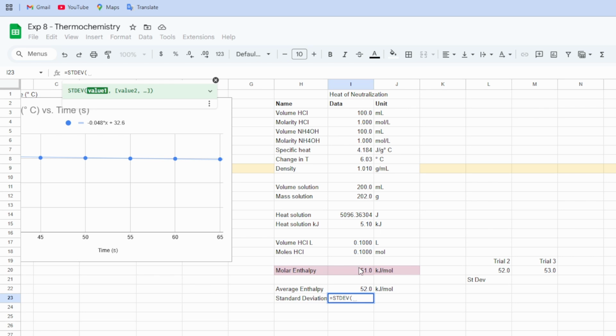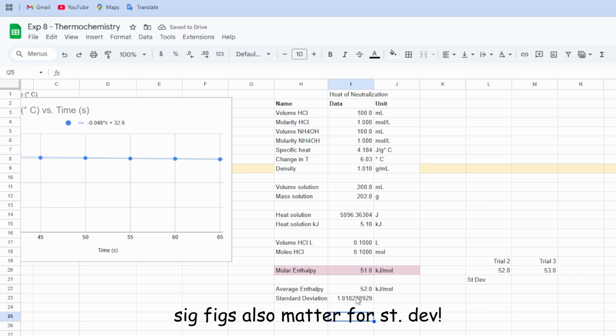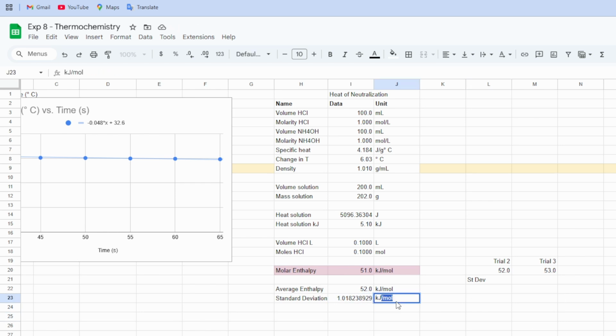You have now calculated almost everything you need for the first half. It's basically rinse and repeat with the heat of solvation, but please pay close attention to the numbers you are required to use for your calculations. As for the theoretical heat of solvation and percent error, I will leave that to you to figure out how to include it in your Excel sheet.